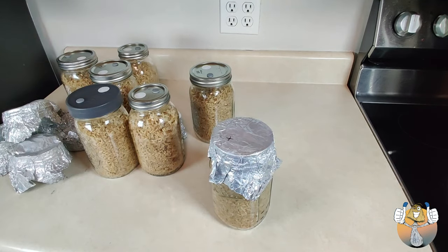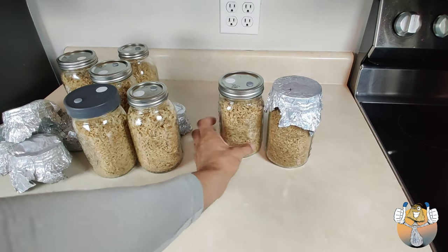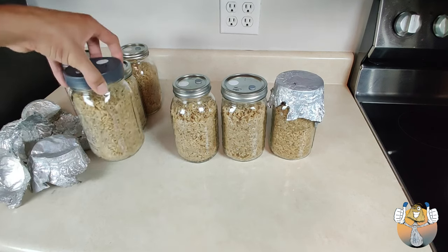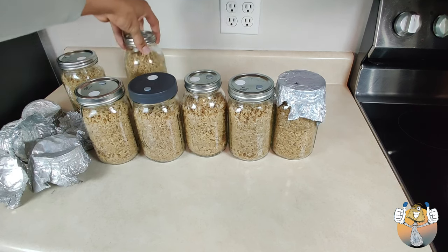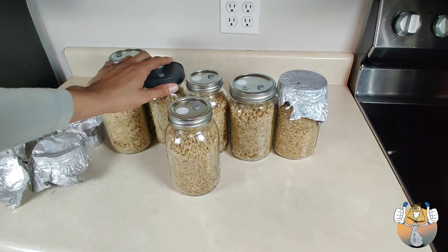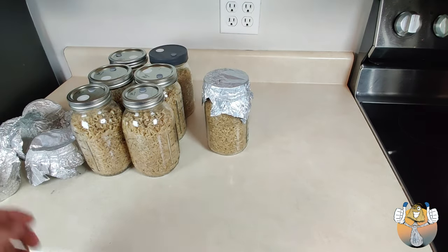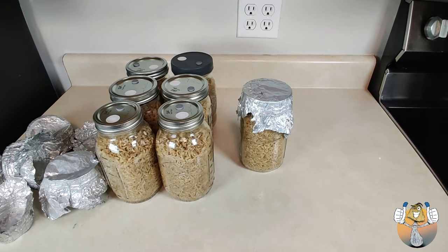And we're just going to loosen our lid back up on our unmodified. And we are going to keep the aluminum foil on top of that lid as well to prevent any contaminants from creeping in, you know? So for our first pressure cook run, we sterilized 7 jars, and for the next run I have 2 more jars that need to be sterilized. So all in all, we used three 2-pound bags of whole grain brown rice and 9 quart jars.